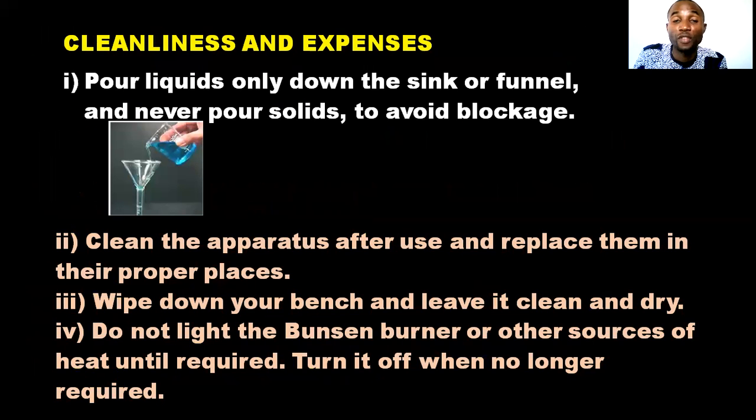All right, we have talked about the danger part of it. Next thing now is cleanness. In terms of cleanness, pour liquids only down the sink or funnel and never pour solid into it, to avoid blockage. In this funnel, pour only liquid. Don't pour solid into it to avoid blockage. That is one of the things you need to know.